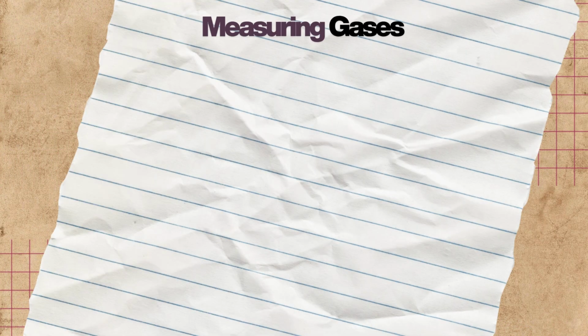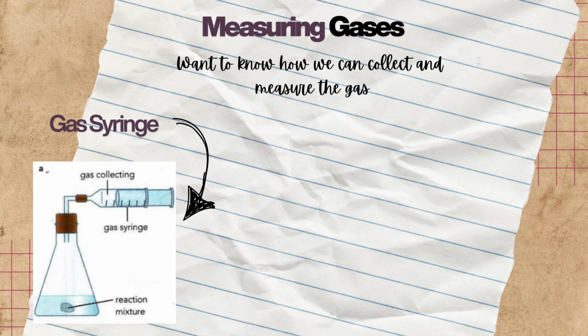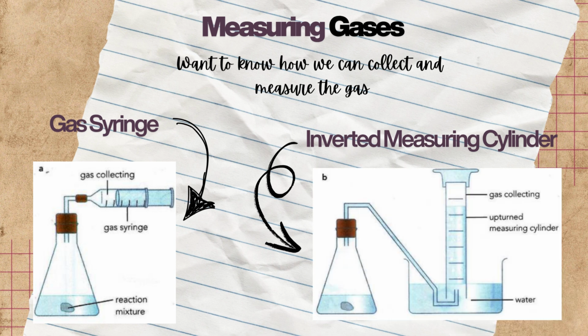Next, if we want to measure gases, want to know how we can collect and measure a gas? First, we have a gas syringe, and second, we have an inverted measuring cylinder. But an inverted measuring cylinder cannot be used for soluble gases as it involves water in it.